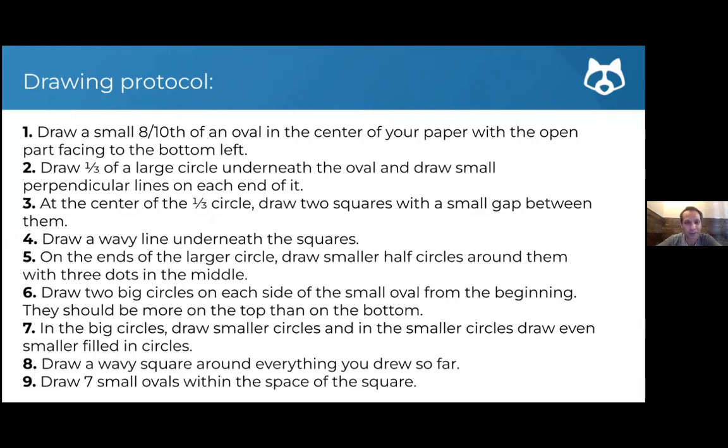So I'm not going to tell you what it is, but I want to see how many people can figure out what this is, what these instructions are for. So take a piece of paper, try to follow these steps.